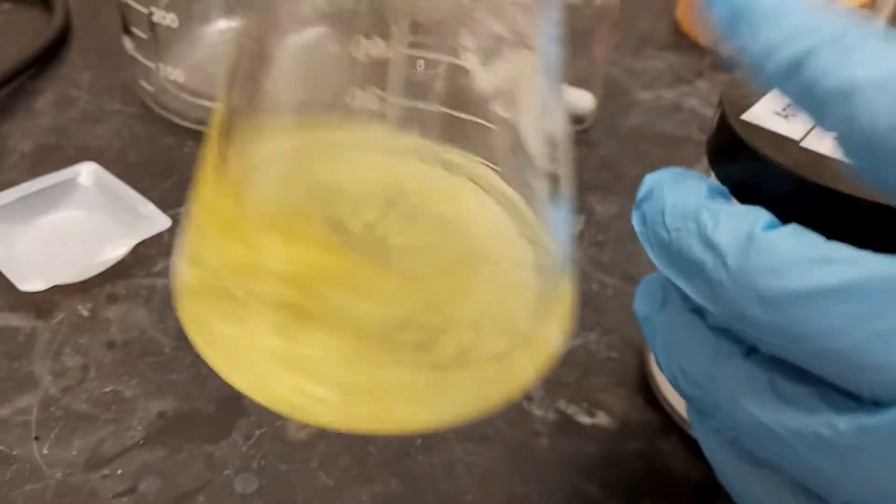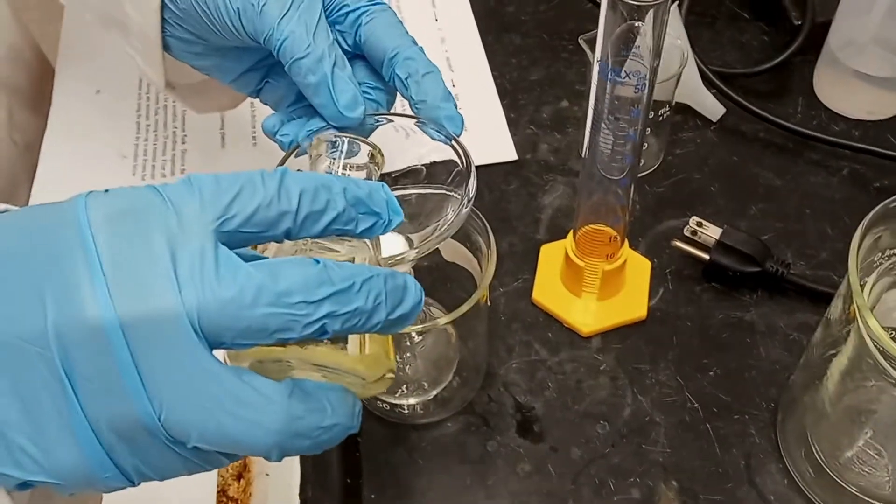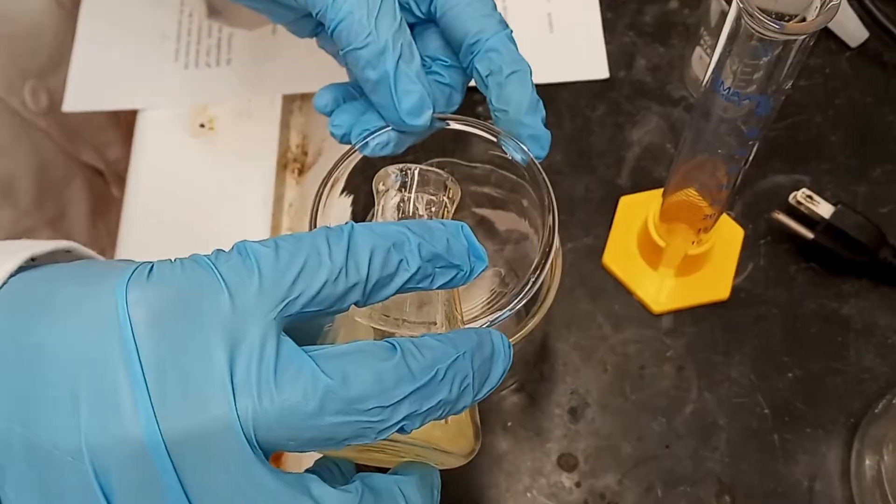Afterwards, we filtered off the drying agent by pouring the mixture through a glass funnel plugged with a piece of cotton into a 50 ml round-bottom flask and rinsed with a little bit of DCM.